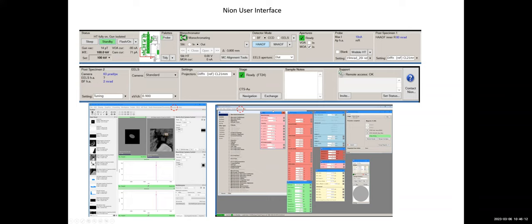And then on the left side are two panels showing some frequent controls of the EELS. Mostly if you just do core loss EELS, you don't need to go to the higher order, which is shown in the EELS tuning panel. You can only use the lower order. So in the tuning part, you can see ZLP tare. This is actually moving the zero loss peak to the correct zero loss position. If you do EELS in other places, you have some controls to bring the peak to make sure that the strongest peak is showing at zero eV. And then if you are doing core loss, you tap a value in the loss prism here to bring the peak you want into the Dectris camera so you can record the peak.